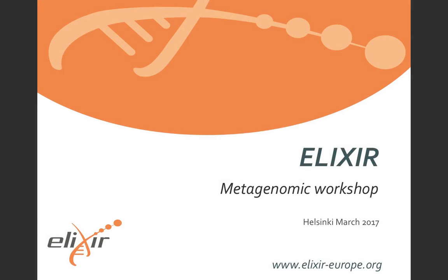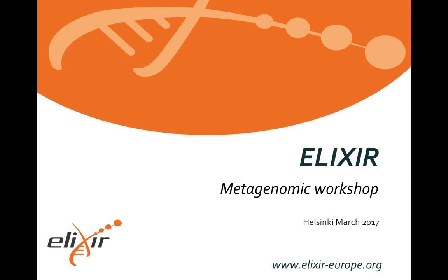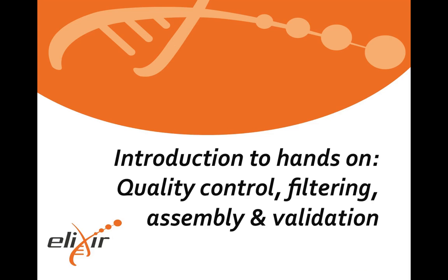Hello, my name is Erik Hjerde, and I will be giving this theoretical introduction to the hands-on exercise that you will be given later. So it's an introduction to quality control, filtering, and the assembly of metagenomic data, and finally validation of the assembly.